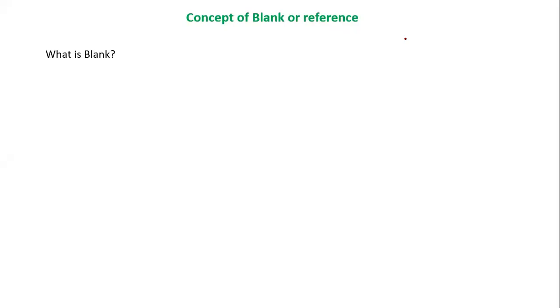It doesn't contain the sample of which we have to find out the absorbance. Right. So can I say this, that blank contains everything except the compound of your interest? Yes, sir. Okay. So now it contains all of it. It means all the reagents without the substance of your interest.